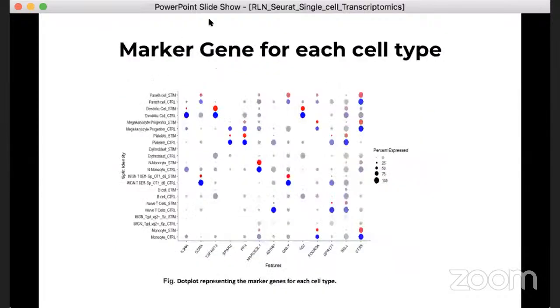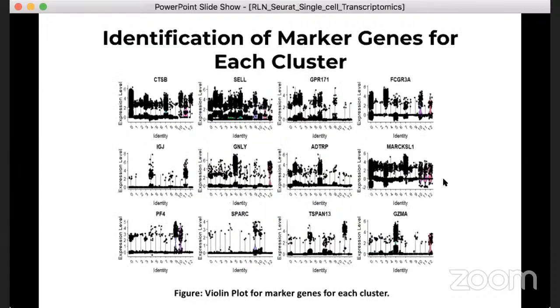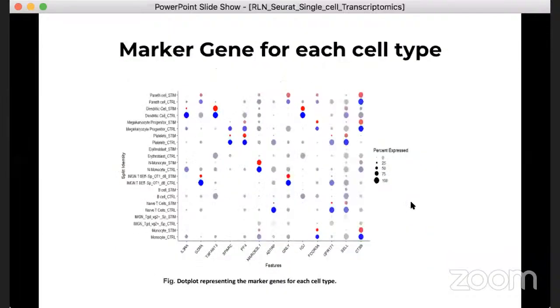For those cases, it is recommended to use dot plots, where the plot naturally shields the noise caused by very low expressed genes or dropout genes. With a lot of cells, a dot plot is more informative than other ways of visualizing the gene expression pattern across different cell types. Here we have only 11 clusters, but when you have a lot of different clusters, the complexity keeps on increasing.